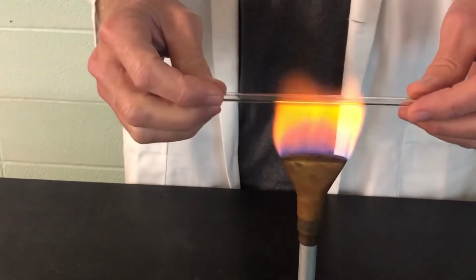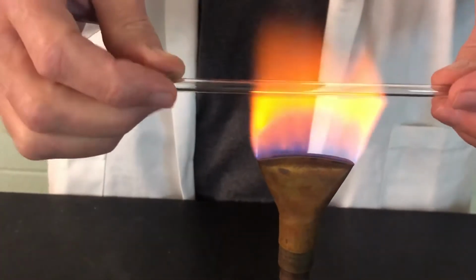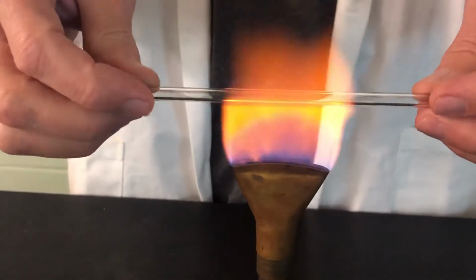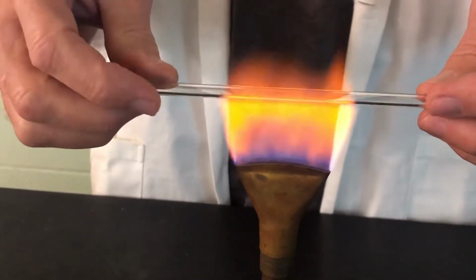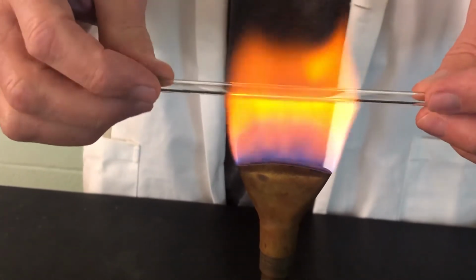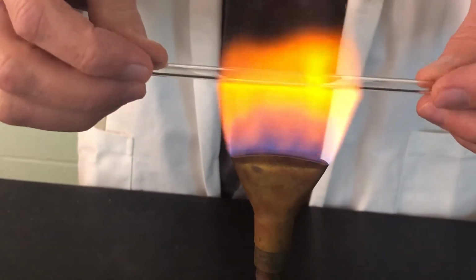Anyway, I'm going to start the bend now. I'll take a piece of tubing that I've already fire polished both ends. I rotate it in the hottest part of the flame. I'm watching for it to start to bend on its own, and then I simply go with that bend to try to keep it as long, gradual a bend as possible.